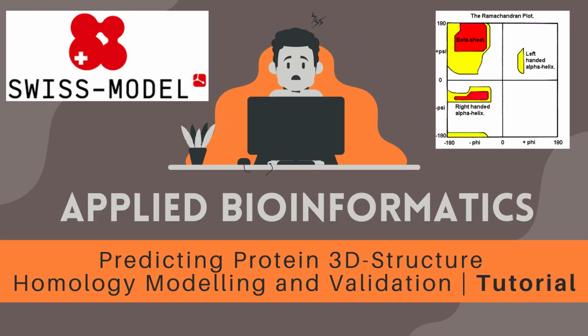Hello and welcome to this tutorial on predicting protein structures using homology modeling. Today I will guide you through the process of predicting the 3D structure of your protein using Swiss model. I will also show you how to evaluate the quality of the predicted models using different quality check parameters including Ramachandran plot.